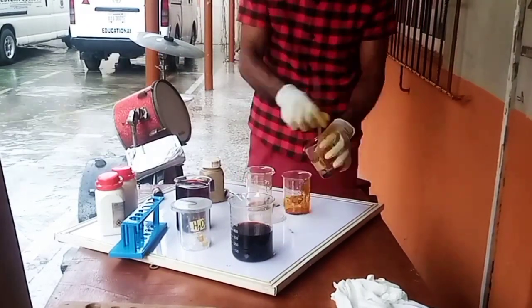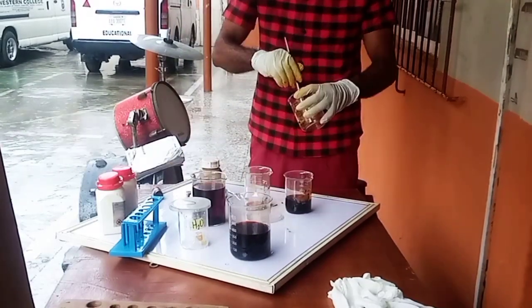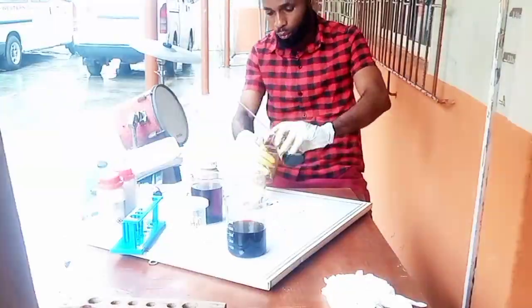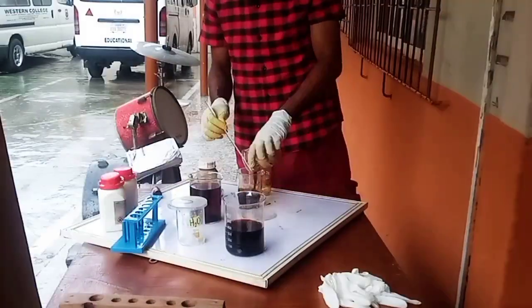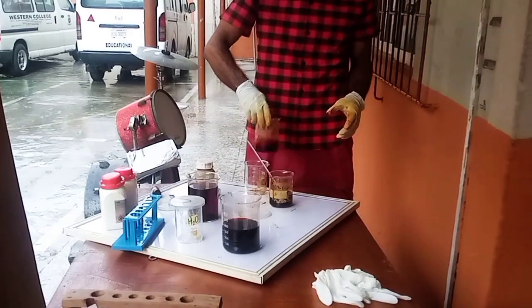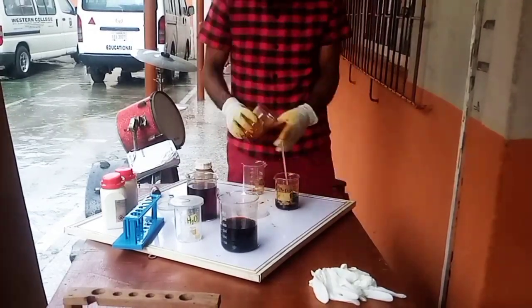Actually, I am done shaking this. I have actually done the good work that I'm supposed to. This took me up to 2 hours 40 minutes. So I need to prepare it and put it inside a volumetric flask. That is what I am doing.